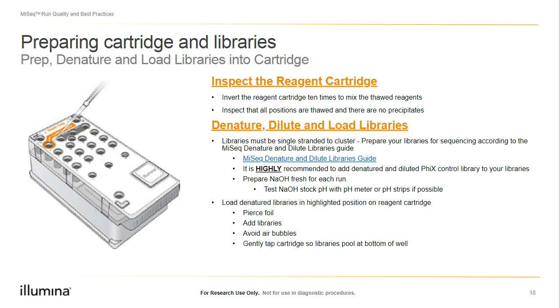We'll also want to prepare the sodium hydroxide fresh for each run, and I strongly recommend testing the pH of the sodium hydroxide stock with either a pH meter or pH strips if possible. This will allow us to be confident our denature will proceed as expected.